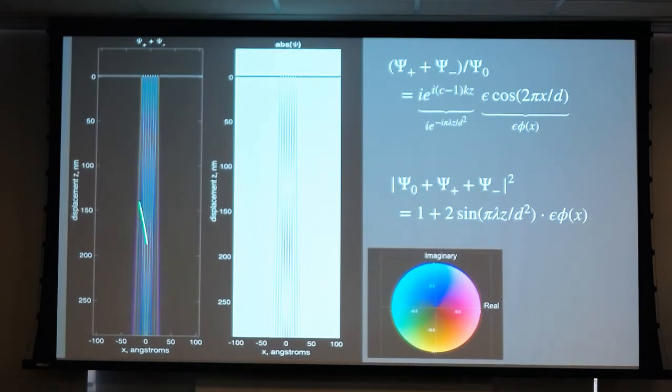Removed, and this is what we've got. Right below the specimen, we have blue and yellow. That is, the waves all have imaginary values. As we move down, we move to a region where we have red and green values, that is, real values of this interfering wavefront. Now it's imaginary again, and here it's real.